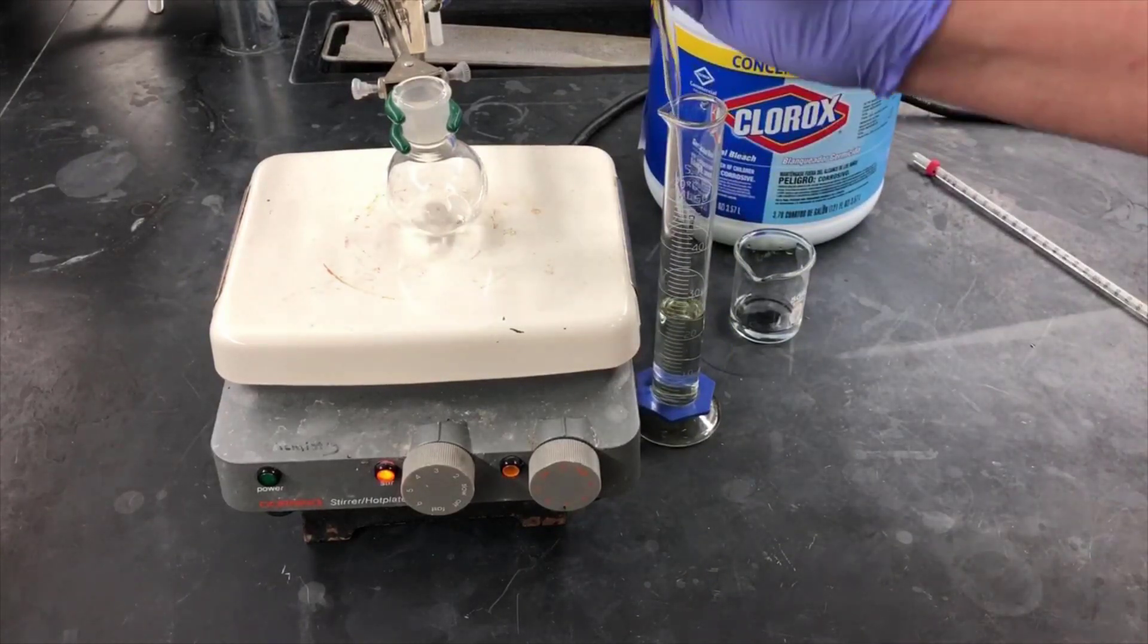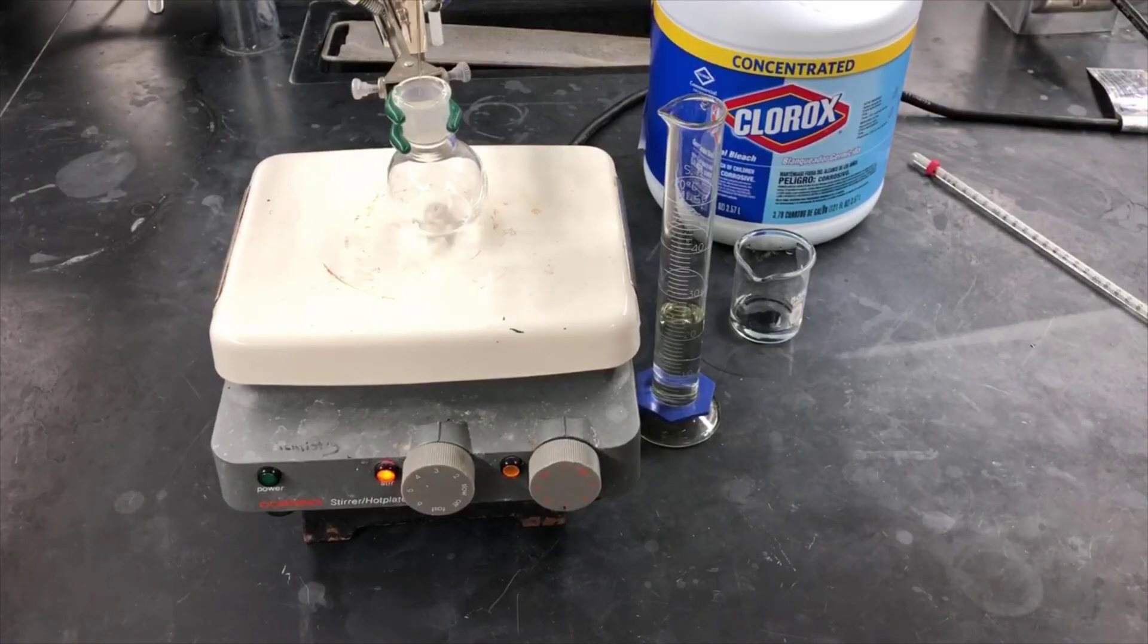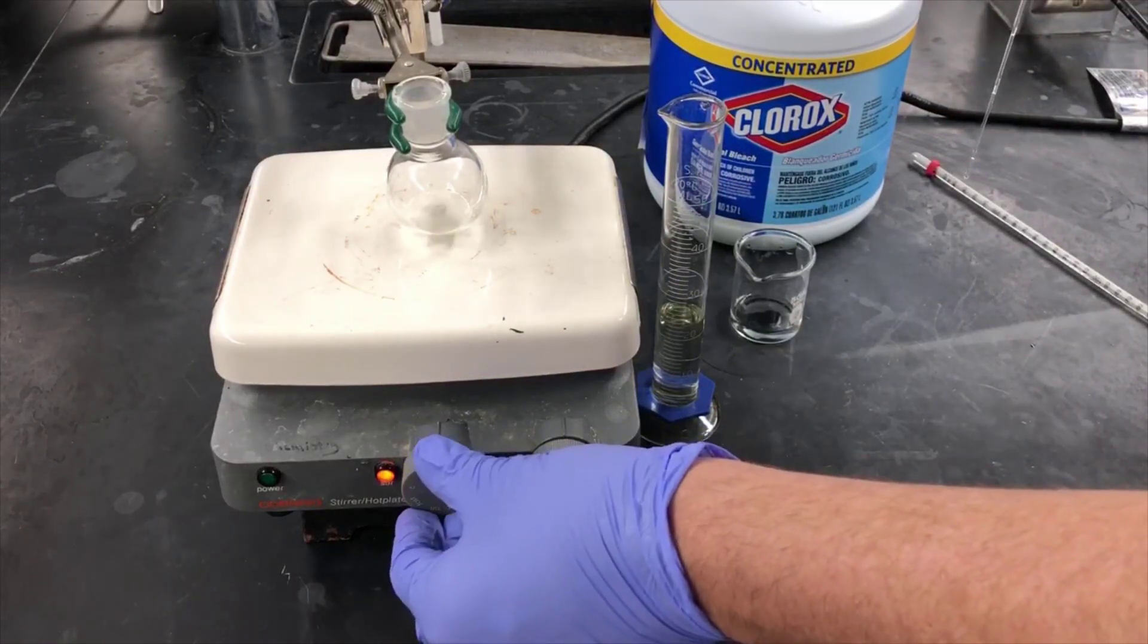Now I'll add the bleach solution to the cyclohexanol. At first, I'm going to be adding it fairly slowly, drop-wise here, with vigorous stirring.